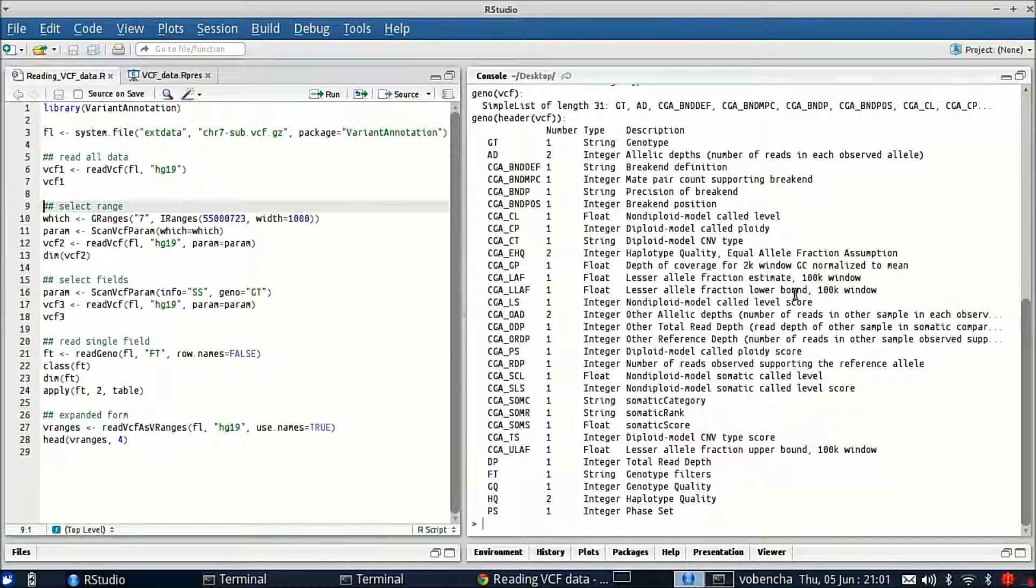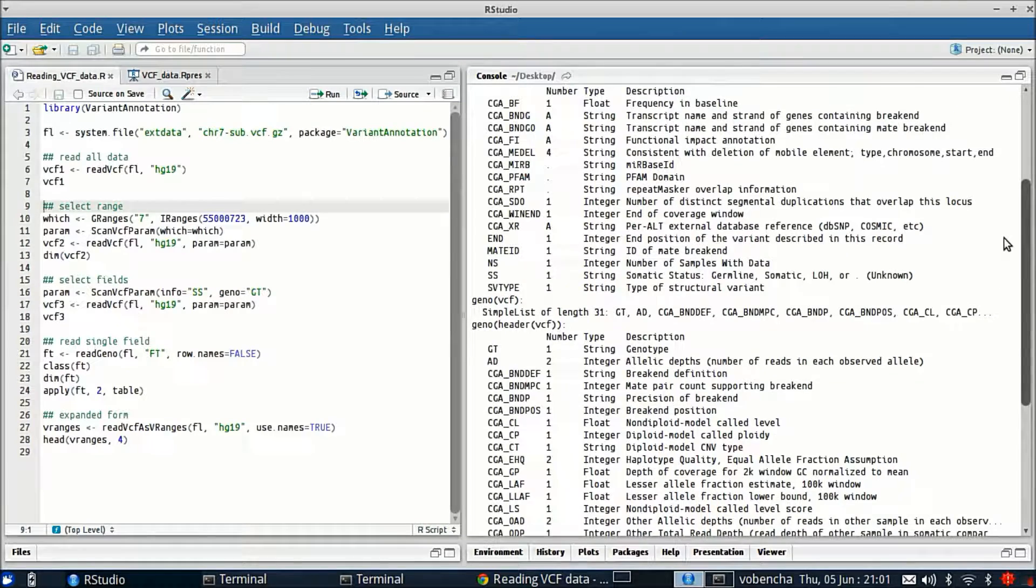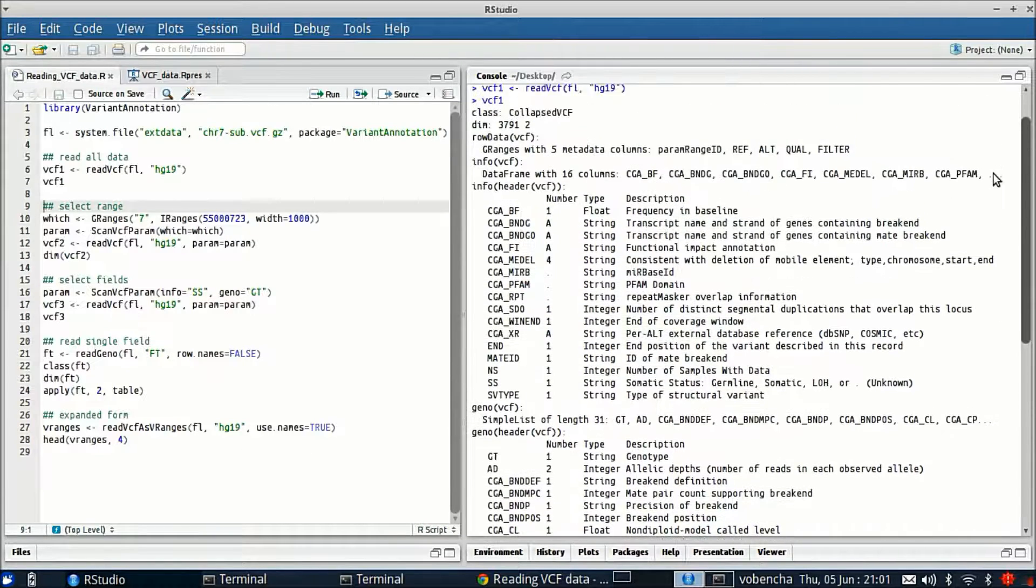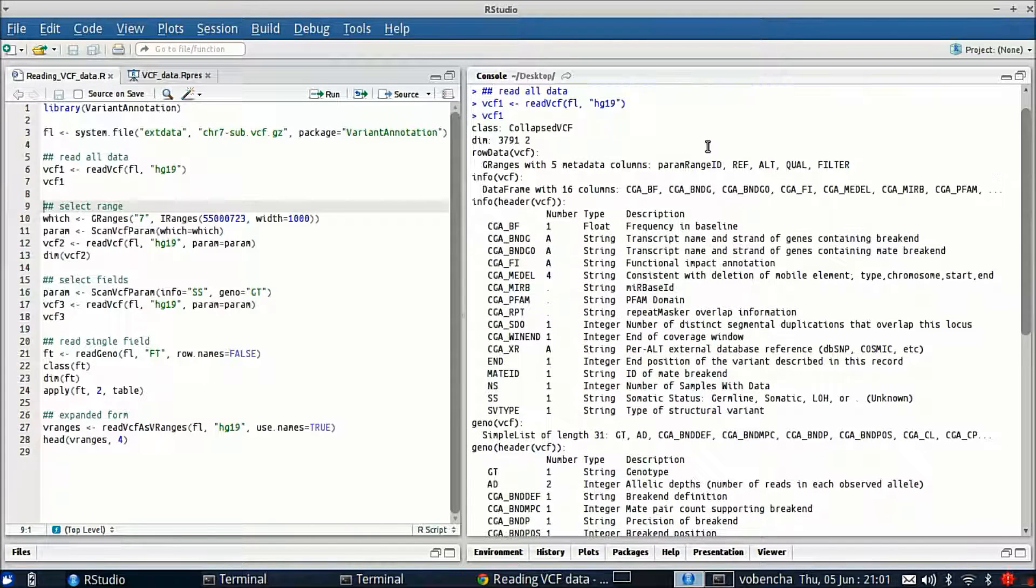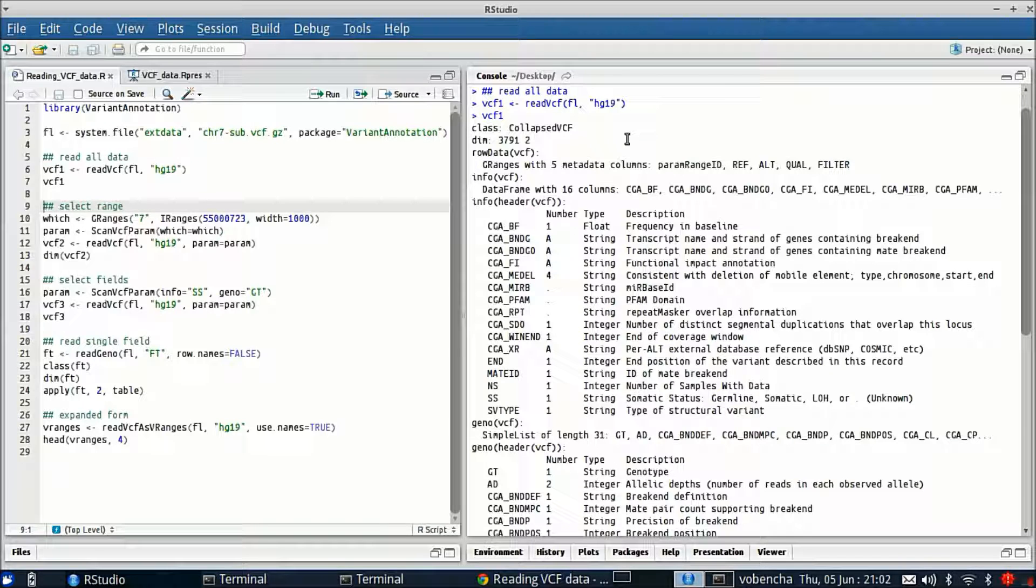Then we're going to take a look at what we've got here. So this is a VCF class and the dimension is 3791 by 2 so we've got 3791 variants and two samples. The data are packaged into different slots in this class.